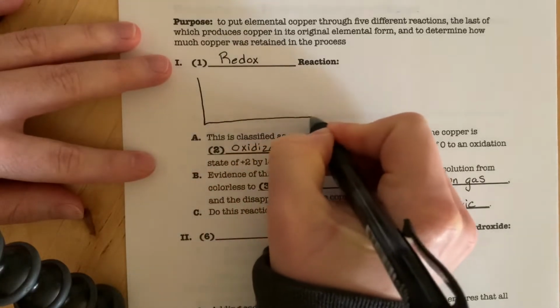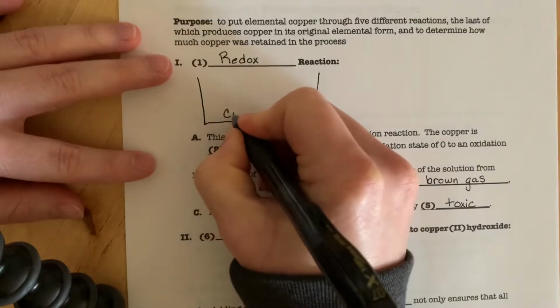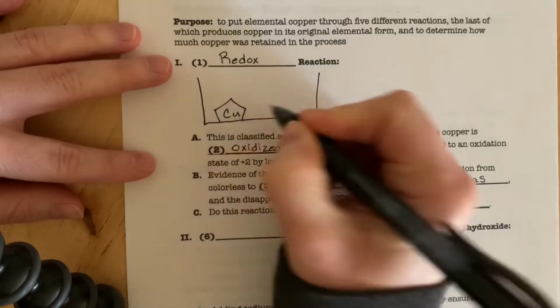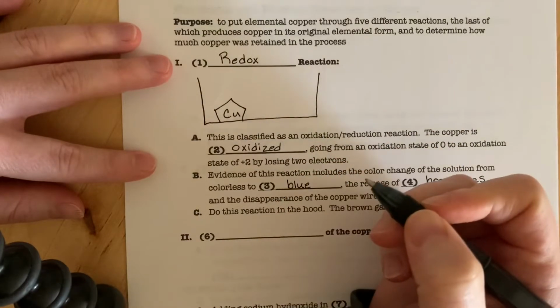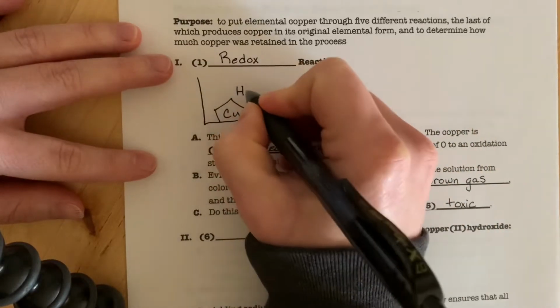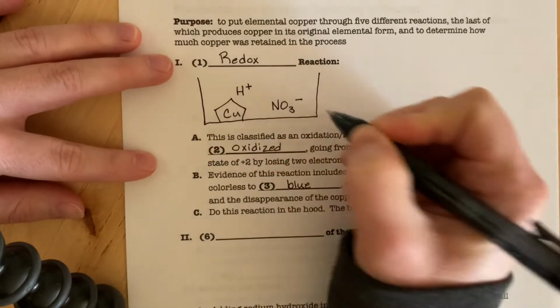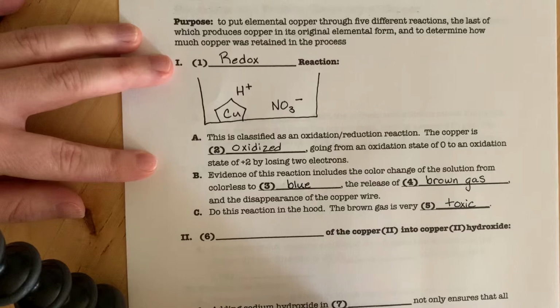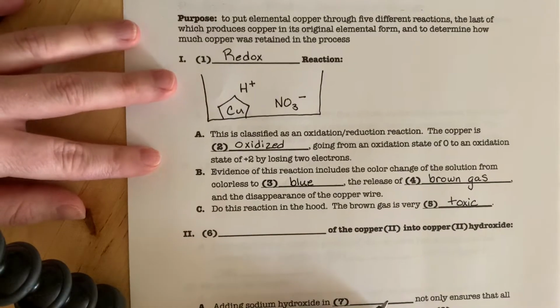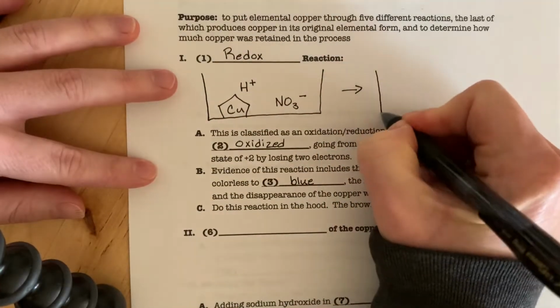So here's my before. Just pretend that looks like a beaker. And so we've got our solid copper sitting at the bottom there. We are adding some nitric acid, which is a strong acid, so it completely dissociates into H+ and NO3-. And refer to the lab manual as you go along with this. The lab manual has all of the balanced equations for each reaction. So I'm just drawing the ions in solution. So what happens after it reacts?